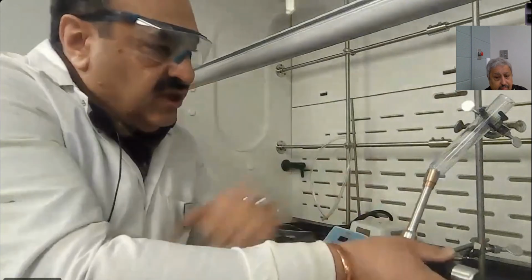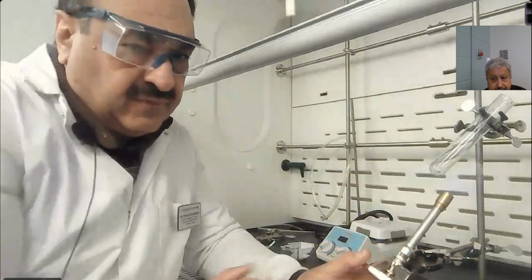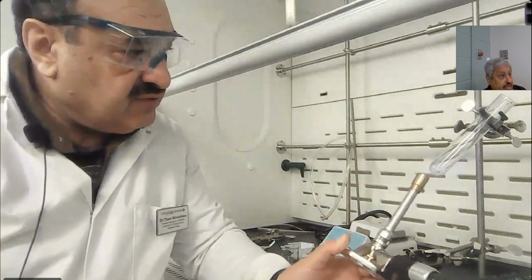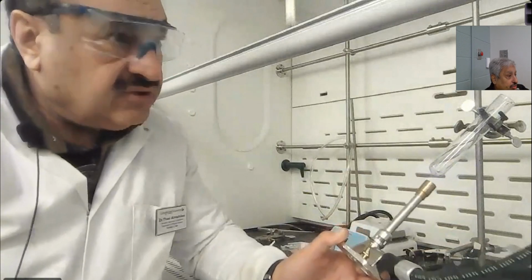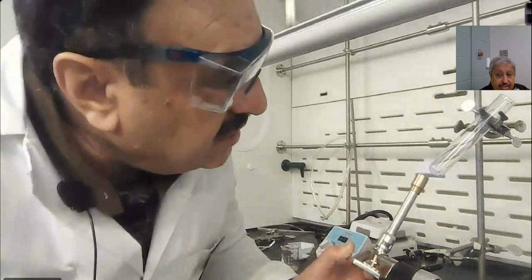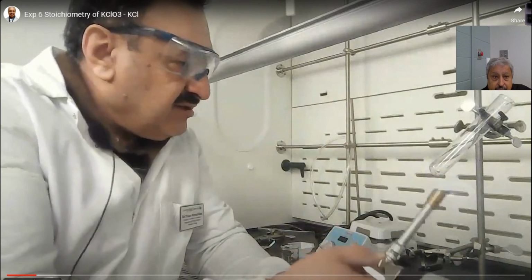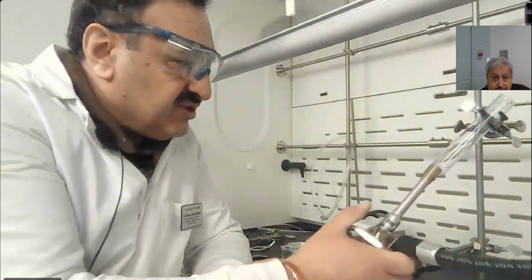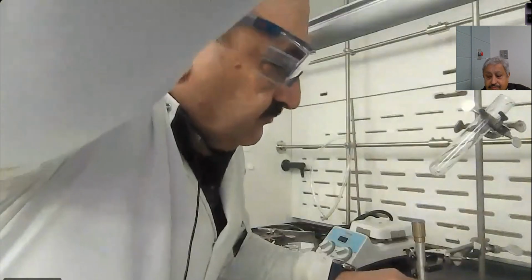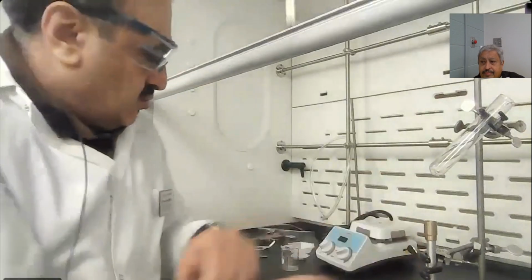We are just trying to warm our test tube for only 1 to 2 minutes, so that there's no humidity inside the test tube. So we will put the flame at the bottom of the test tube. You start with the test tube empty, to get all the fingerprints and impurities out. Don't put anything inside, empty. Let me check, we are good. Turn off the Bunsen burner. Okay, and wait until the test tube cools down.